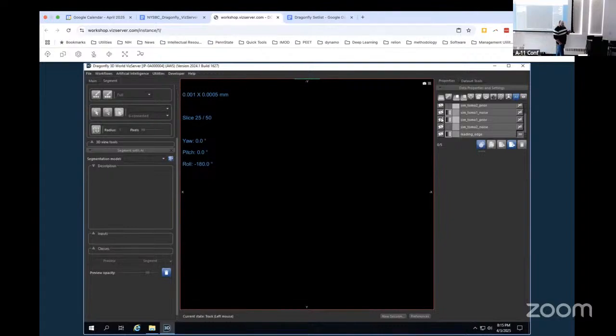And so that's what our ground truth is. And in fact, good question. We can maybe go through generating some of that. We don't do it in Dragonfly though. You'll have to. Yeah, well, we'll see how much time we have. If you have time later, I definitely want to see. Okay. All right. So, in fact, we'll just get to that after this.